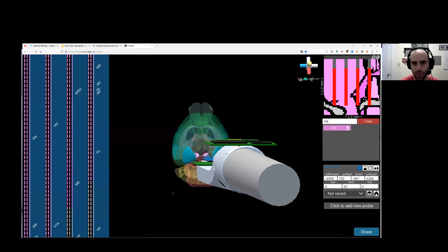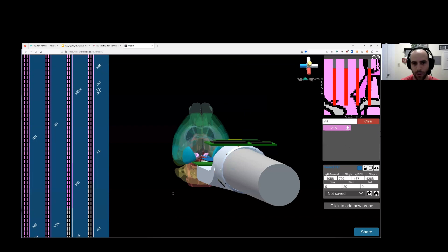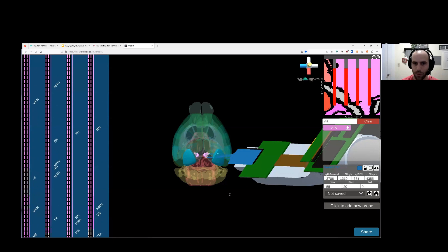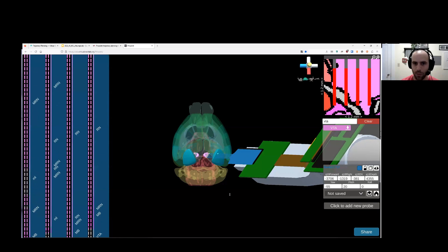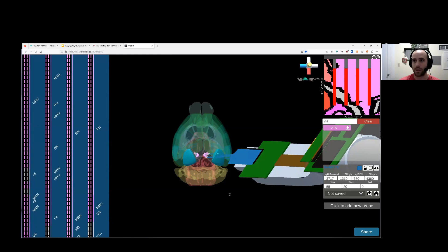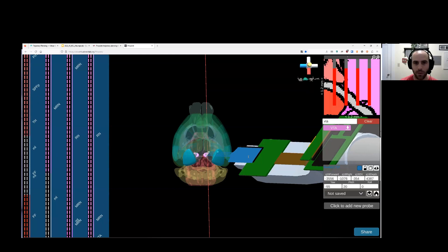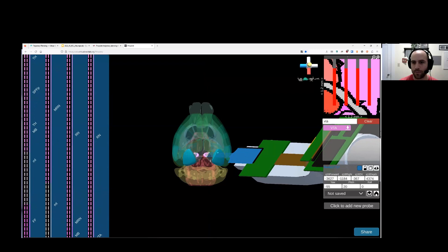So right now, I'm going to use the F key to change the angle of the probe. I'm going to use the 1 key to rotate the probe. And I'm just trying to set up a trajectory here. But we support both keyboard clicks. We also support controllers. So if you have a PlayStation controller, you can use that to move probes. And we also support clicking on the probe. So right now, I'm holding the left mouse button down. I'm picking an axis key. So here, I hit W for the AP axis. And I'm just dragging the probe through space to move it.